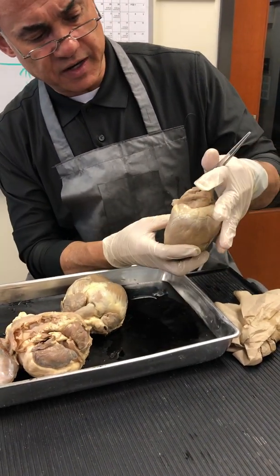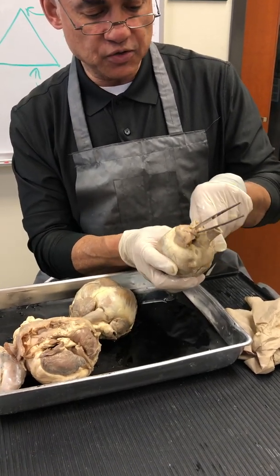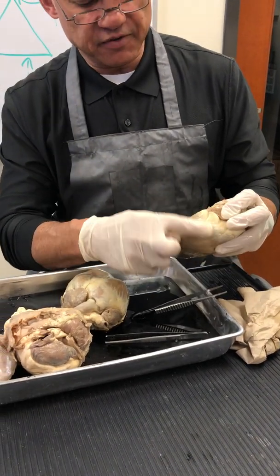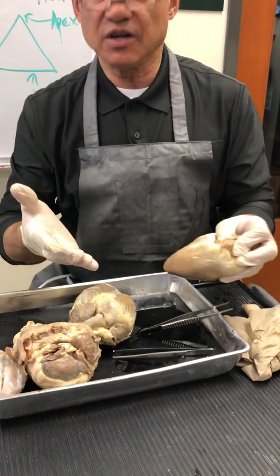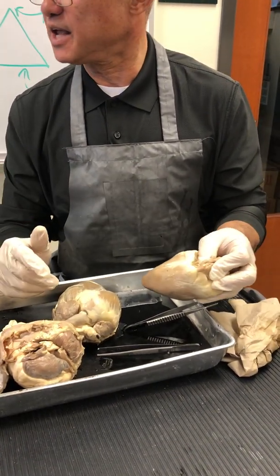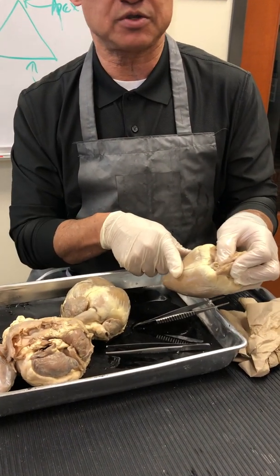So there's the superior vena cava, there's the inferior vena cava. Then, before you do anything else, what I want you to do is peel back. And notice there's some fat around these, not a lot of adipose, because deer out there in nature have tough lives. Right? A lot of them are comfortable, but not as comfy as domesticated animals. The sheep hearts, deer hearts, human hearts, tons of adipose.